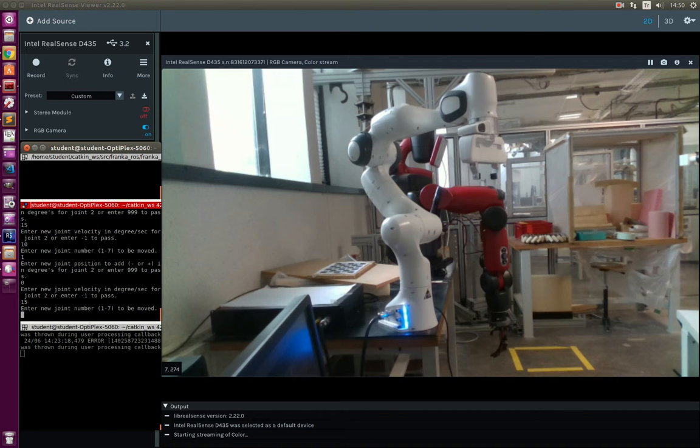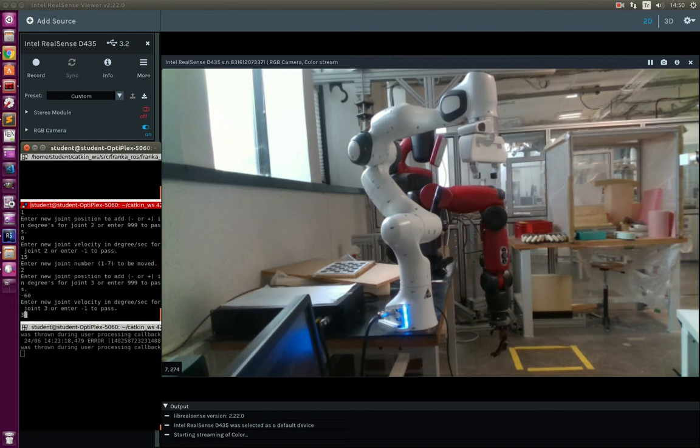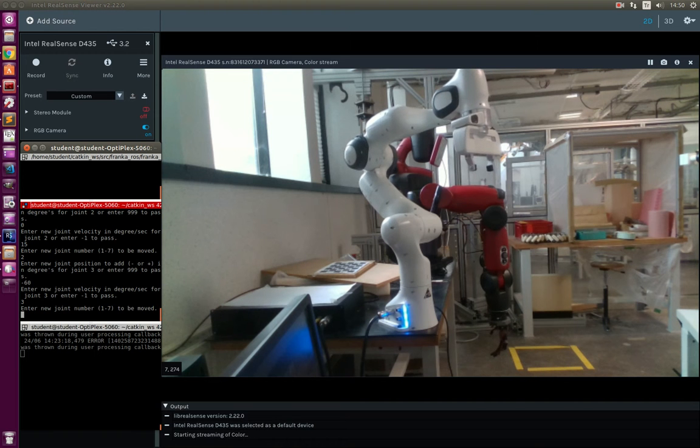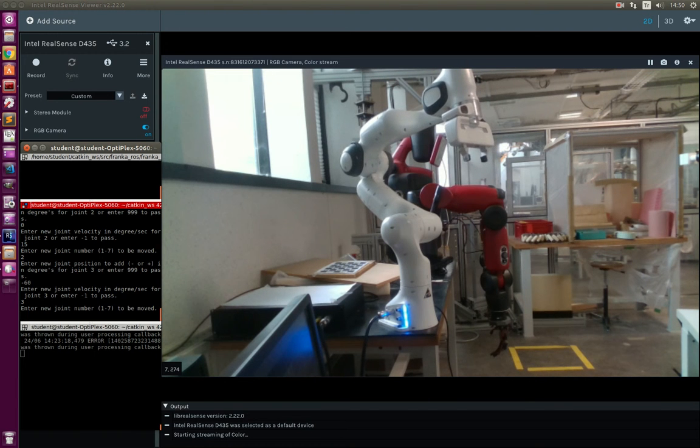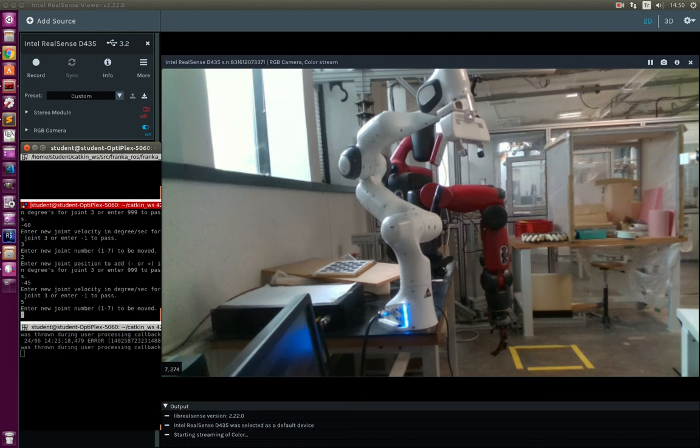Now I will proceed with the second joint. I am sending the second joint to minus 60 degrees with 3 degrees per second. Not much problem.